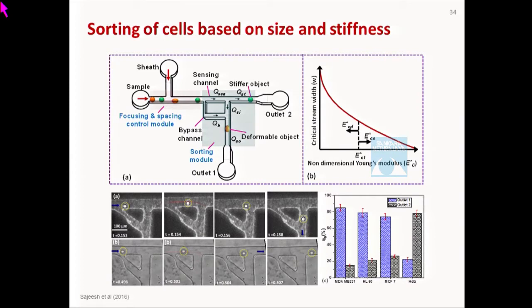Now, we have used that for cell sorting. So this is a particular design.